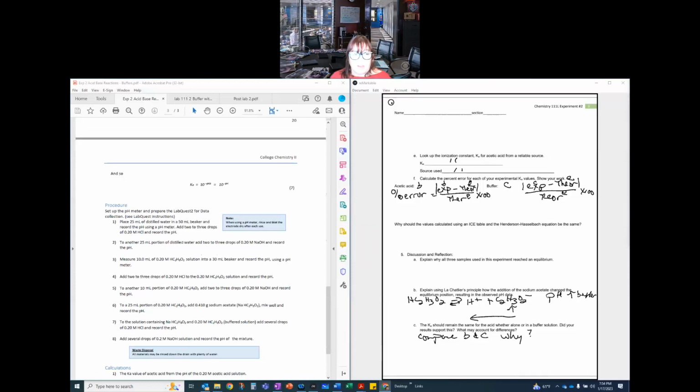I want real reasons, and human error is never what we're looking for. It could be that one of the solutions is contaminated. It could be that we took the measurement on the pH at the wrong time, so we'd already added HCl or NaOH, whatever. I mean, there are things that could have happened here that we might need to think about. Not clean glassware, contaminated solutions, mismeasurement of the concentration of the sodium acetate, which affects the balance of the acid to base ratio in the buffer. Lots of things can happen.